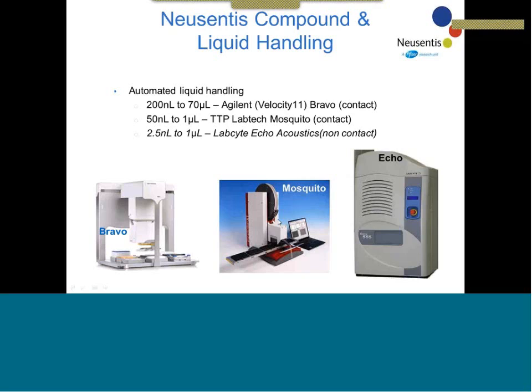So how do you then minimize time and maximize throughput? For example, thanks to the SBS standard plate layout for the IonFlux, we're able to dispense compounds directly from a DMSO stock plate into the IonFlux plate consumable on, for example, the Mosquito, and then simply dilute the plates with external buffer afterwards.